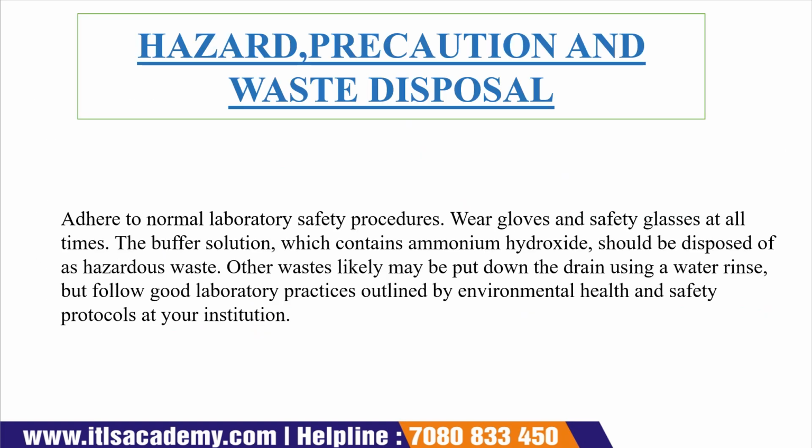Now the next one is hazard precaution and waste disposal. We all know that we are using corrosive and irritant chemicals, so when we are using them, we have to take care. We have to wear gloves and safety glasses, and the buffer also contains ammonium hydroxide. When we dispose of the waste, it should be disposed of as hazardous waste, and other waste can be drained out with a water rinse. And all good laboratory practices should be followed.